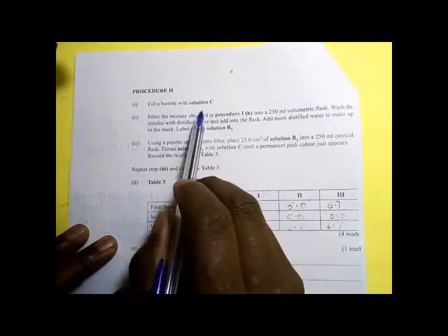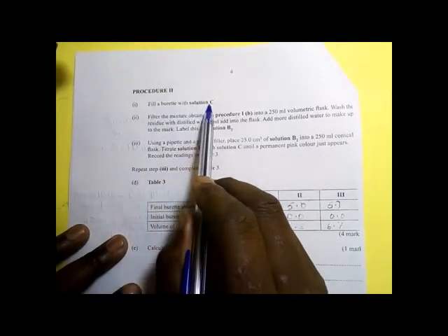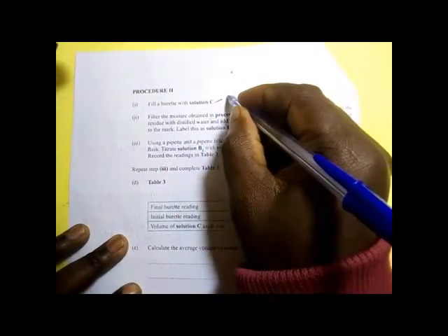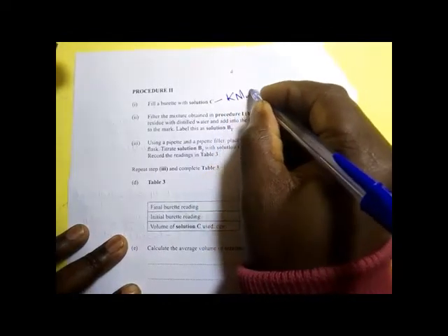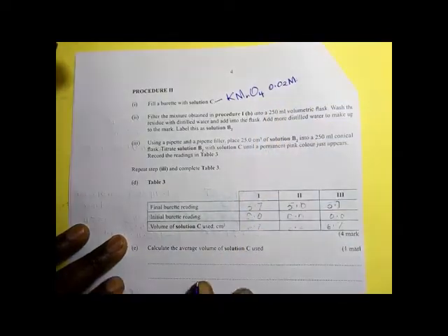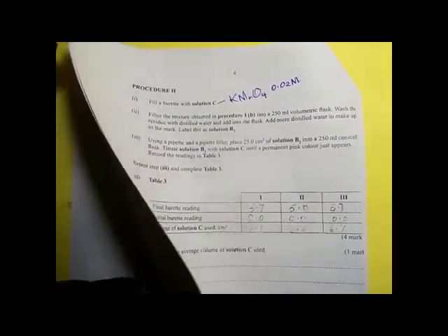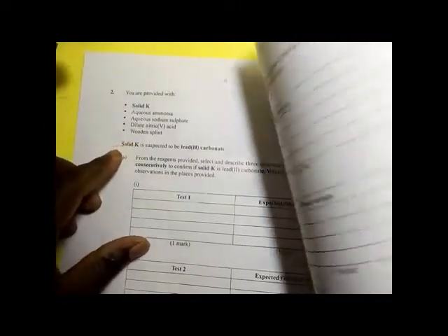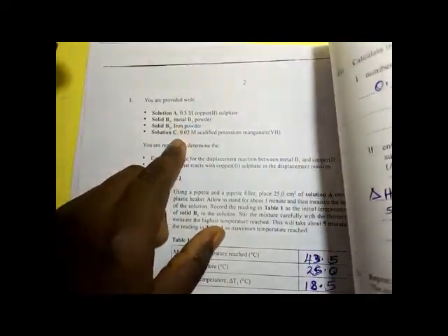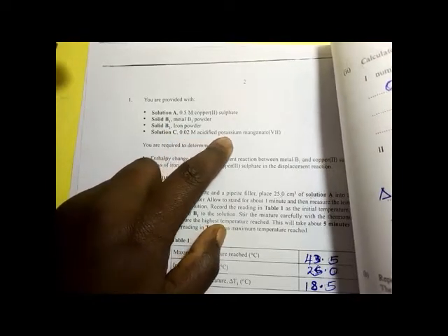Now let us look at the titration part of it. Procedure 2. Fill the burette with solution C. Remember, solution C is potassium permanganate, and it is 0.02 molar. So that is something that you must always try to remember from what you are provided with. You are provided with solution C, 0.02 molar acidified potassium permanganate 7. Don't forget that.